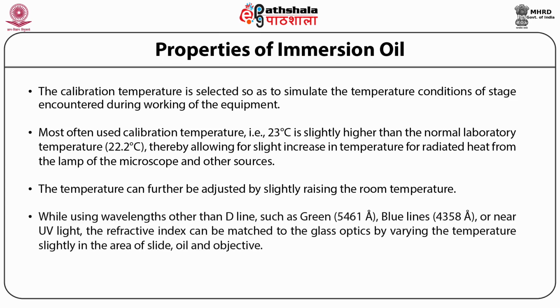While using wavelengths other than D-line, such as green, which is 5461 angstroms, blue lines, which is 4358 angstroms, or near UV light, the refractive index can be matched to the glass optics by varying the temperature slightly in the area of slide, oil, and the objective.